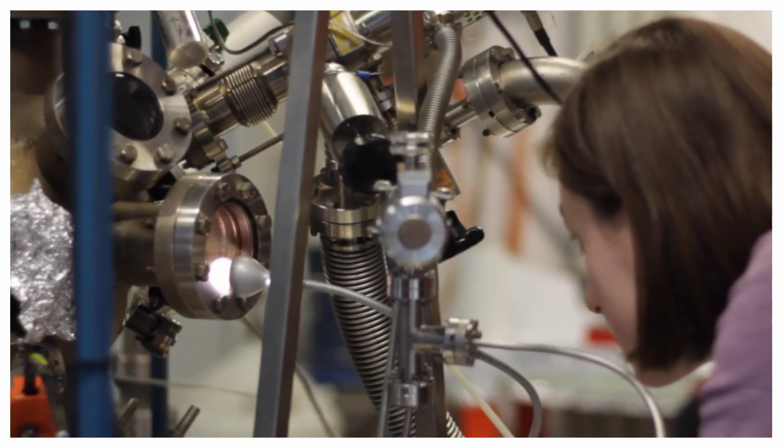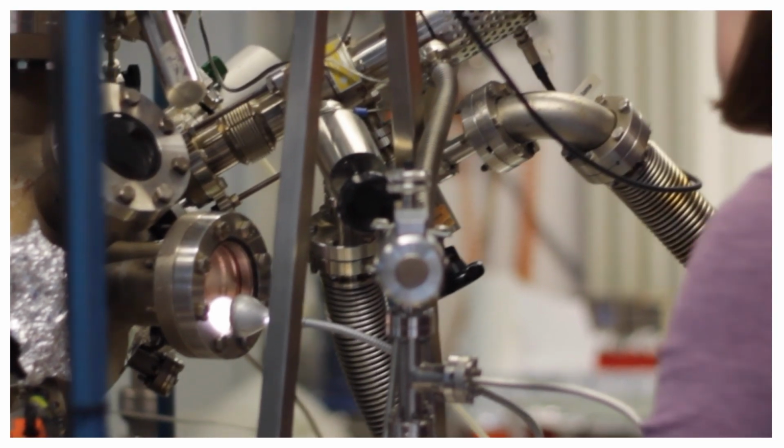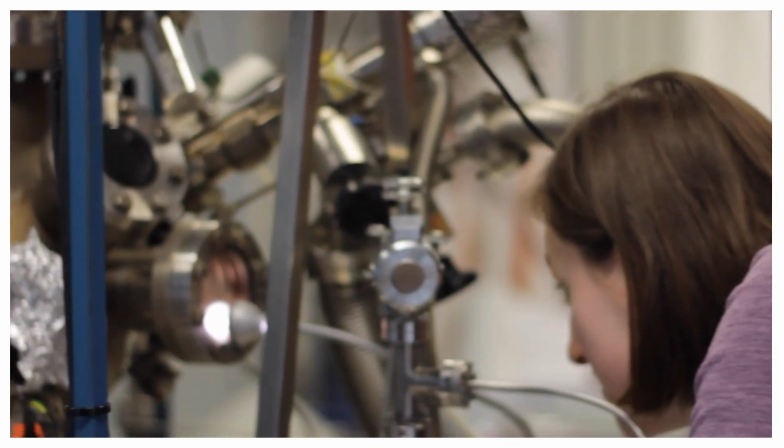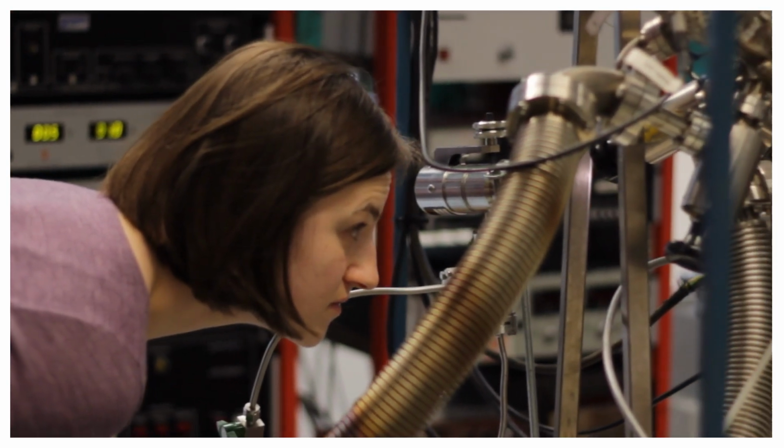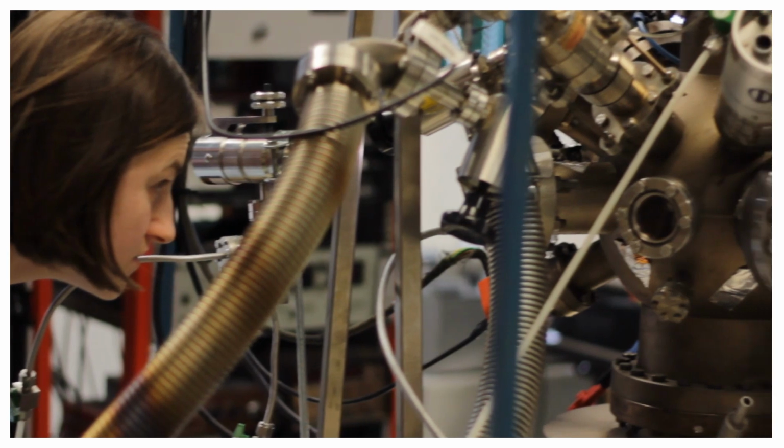So here at the NFFA, there is a researcher who has worked with my specific material before, so I am able to learn from her about this material, how to grow it, and at the same time, I have access to different powerful experimental techniques. So here I'm combining XPS and UPS in one ultra-high vacuum system. I am able to do electron beam growth, and then I am able to look at my surface in a low temperature STM. And this combination is really powerful for me because we are able to make decisions in real time based on the information we have.